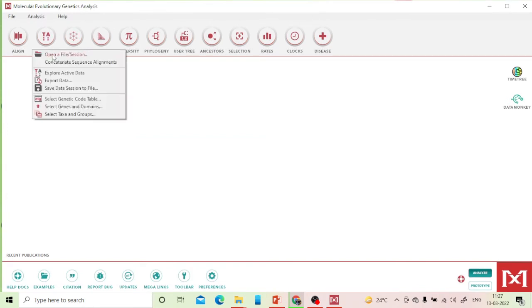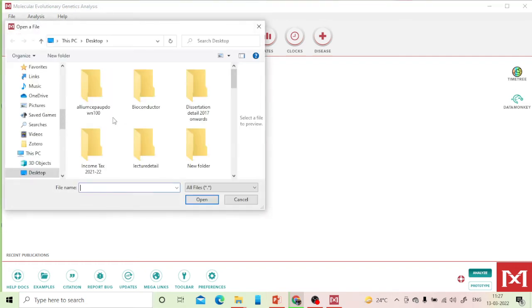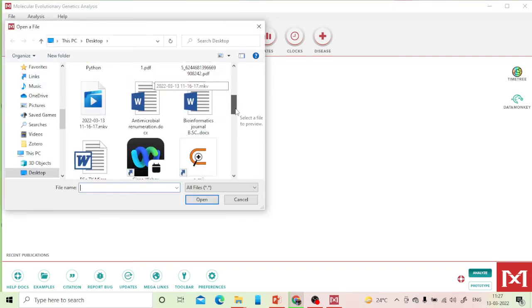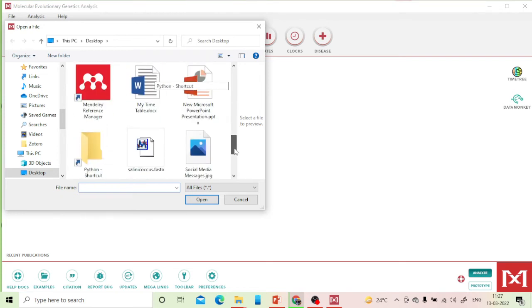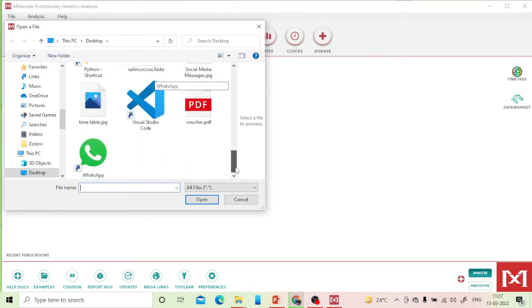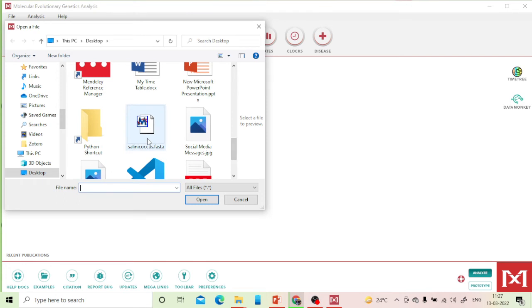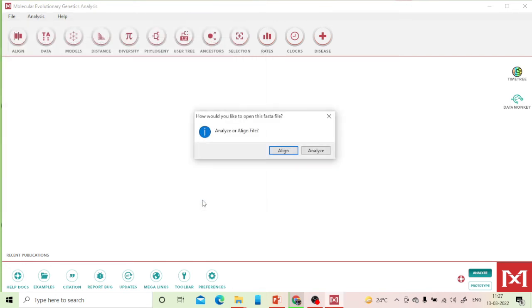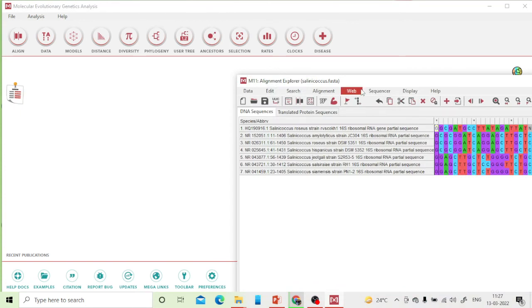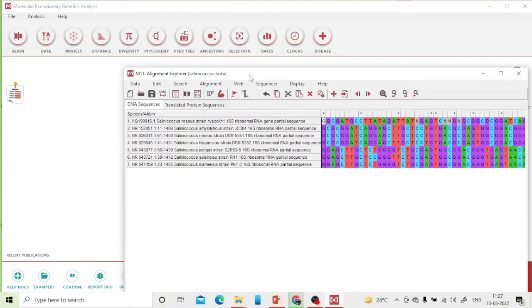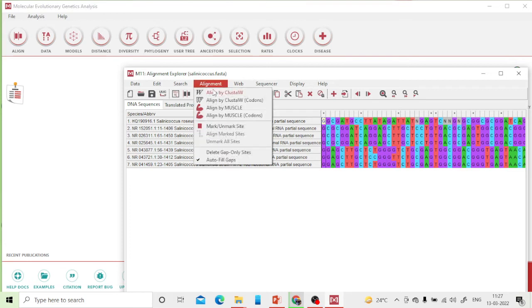Click on 'Data', then 'Open File/Session', go to the desktop, and open the file 'salinococcus.fasta'. MEGA will ask whether you want to align or analyze. Since we need to perform multiple sequence alignment first, select 'Align'.